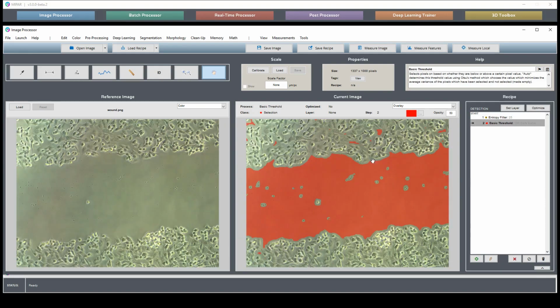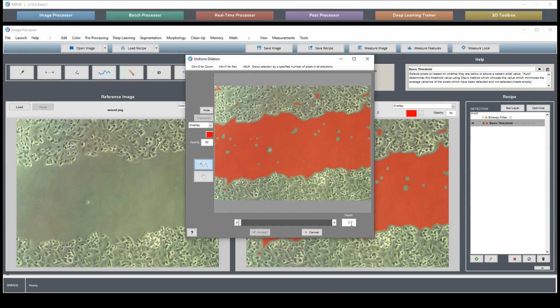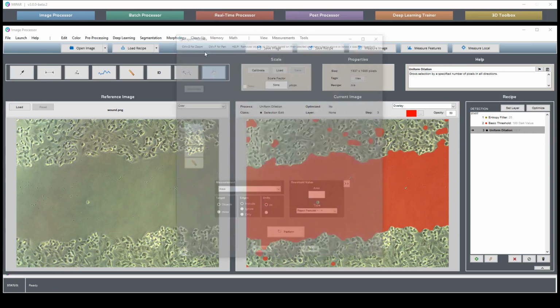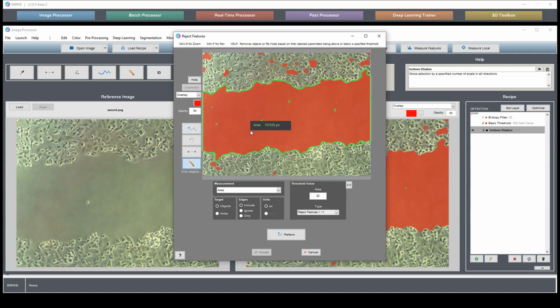So once you've got your segmentation, you need to adjust that. So that's what we'll do, is we'll dilate by half the size of that window. So if we dilate by 12.5 pixels, that will restore our boundary to where it's supposed to be. And now we can just do some quick cleanup.